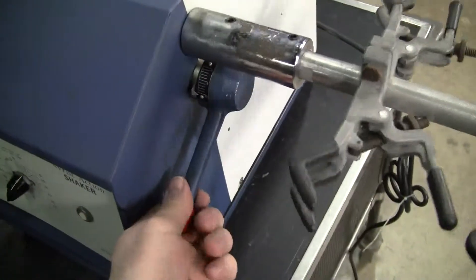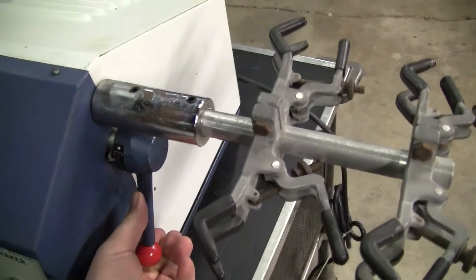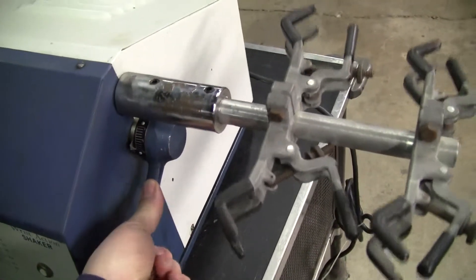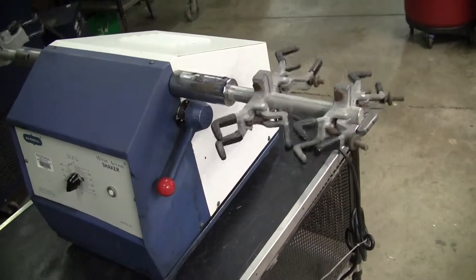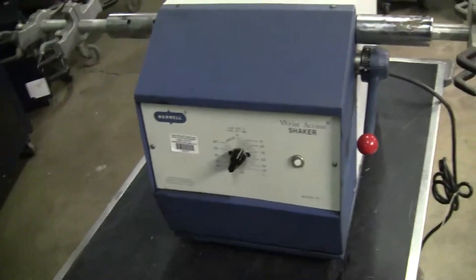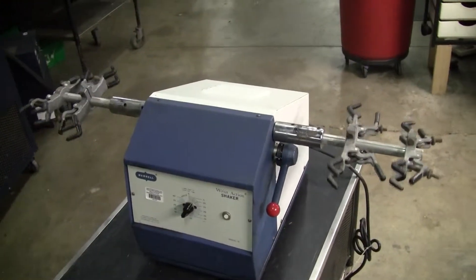This lever increases or decreases the amount of shaking going to the arms, so the angle increasing and decreasing. If you have any further questions, please don't hesitate to call 609-518-9100. Thank you from Hi-Tech Trader.